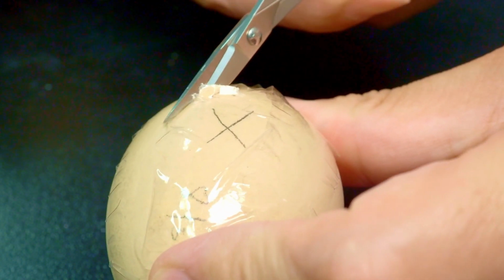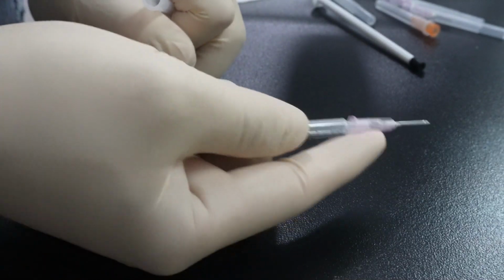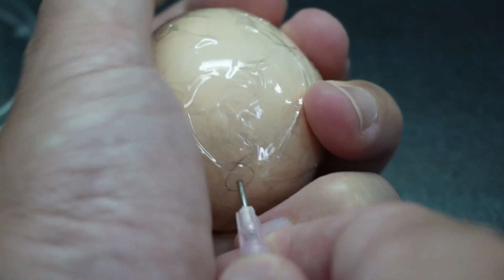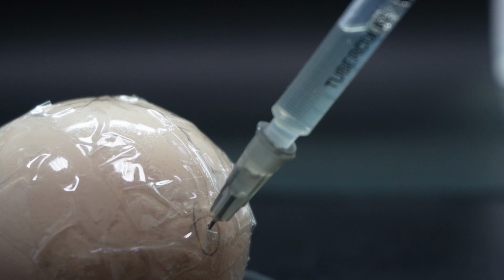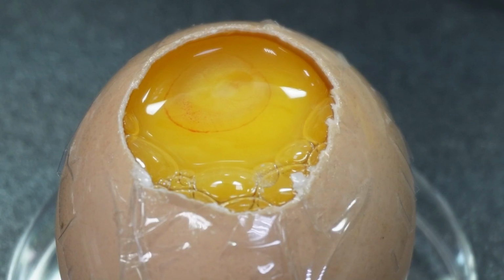The guide mentions using a custom-modified syringe needle, bent just so. A bit of lab hacking. Sort of, yeah. To carefully suck out the albumin without disturbing the yolk or the embryo sitting on top. Clever. Okay, albumin gone. But the embryo's still pale against the yellow yolk, right? How do you see it clearly?